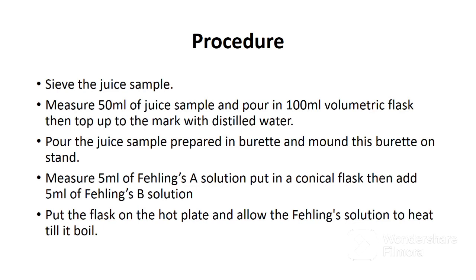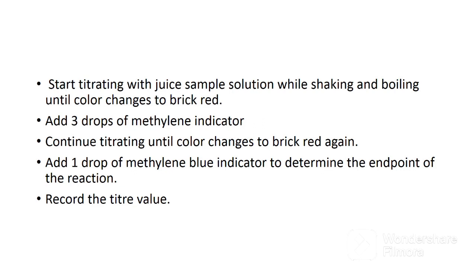Then top up with distilled water to the mark. Pour the prepared sample into the burette and mount this burette on the stand. Measure 5 ml of Fehling solution A and put in a conical flask, then add 5 ml of Fehling solution B. Put the flask on the hot plate and allow the Fehling solution to heat until it boils. After the Fehling solution has boiled, start titrating with the juice sample from the burette while shaking and boiling until the color changes to brick red. Add 3 drops of methylene blue indicator. Continue titrating until the color changes again to brick red. Add a drop of methylene blue indicator to determine the end point. If you add a drop and the solution remains brick red, that means all the copper ions have reacted. Record the titer value.